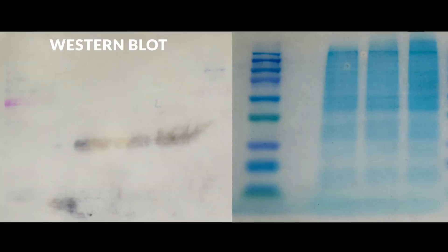Looking closer at the final products, we can see that there are clear differences between the Western blot and the Coomassie stain. The Western blot shows individual bands whereas the Coomassie shows a smear from top to bottom. These results indicate our target proteins are present in the sample and also their size. However, several other proteins are also in the sample, so it needs to be purified if we want a pure sample of our target protein.